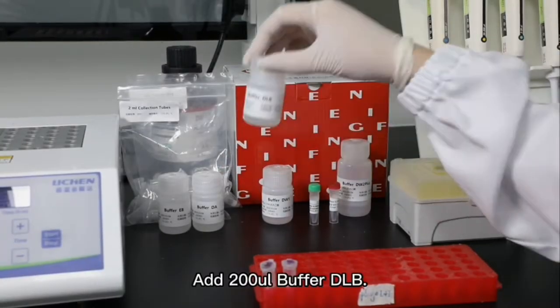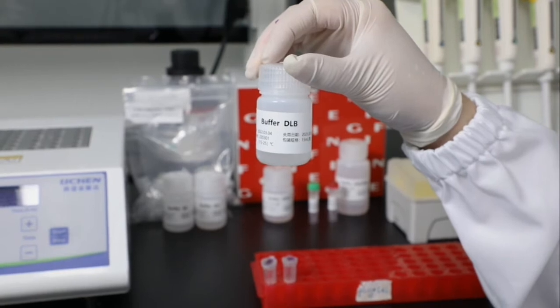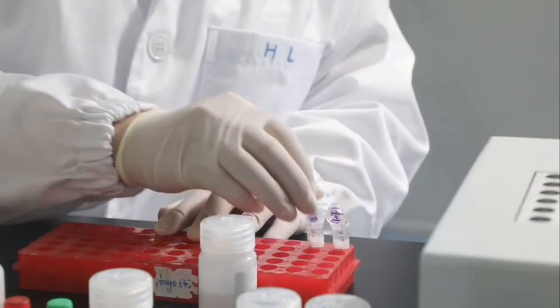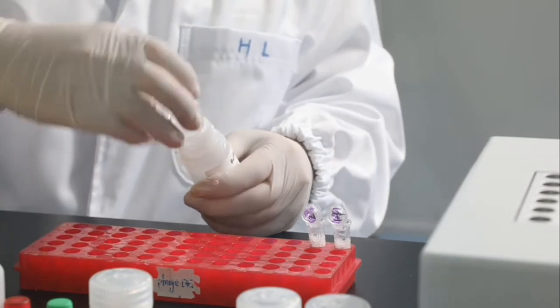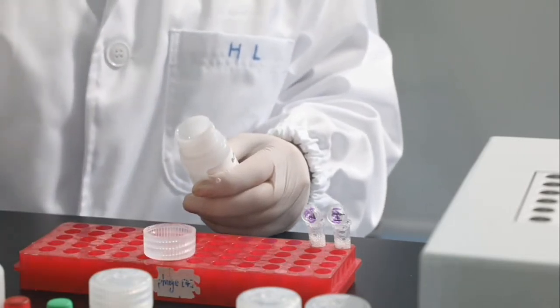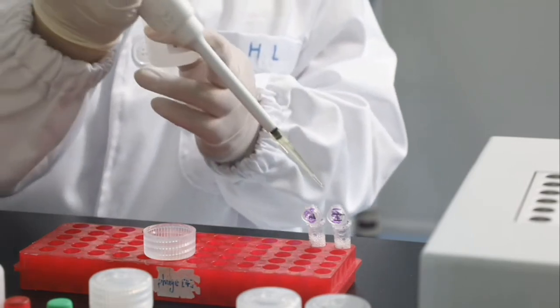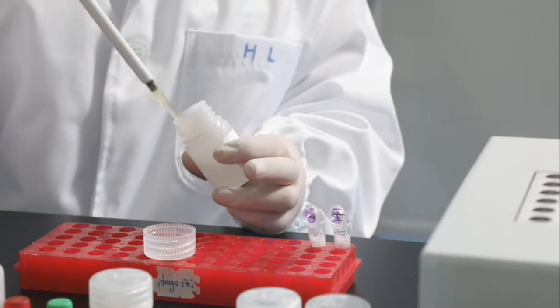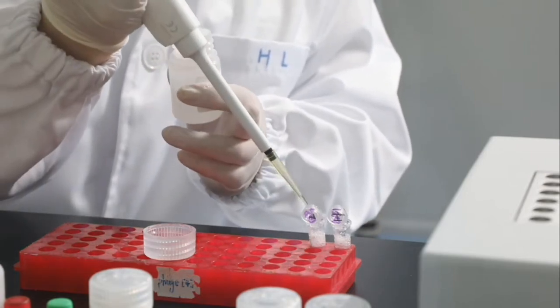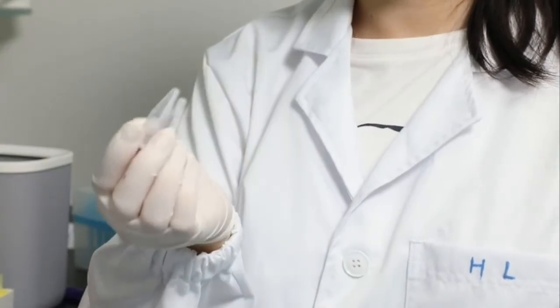Add 200 microliters of buffer DLB. Mix slowly by inverting the tube.